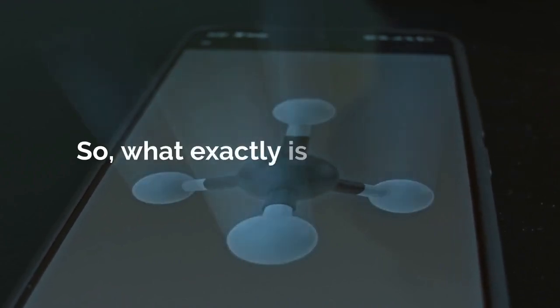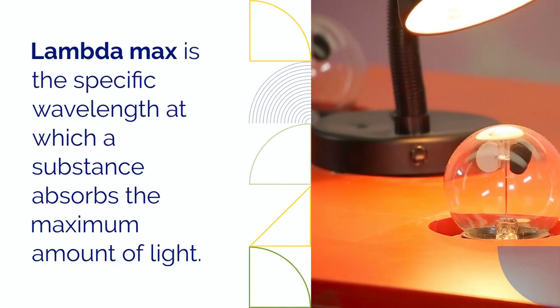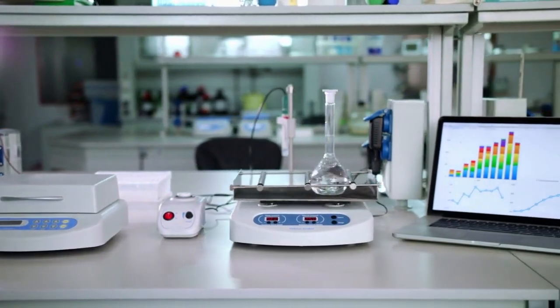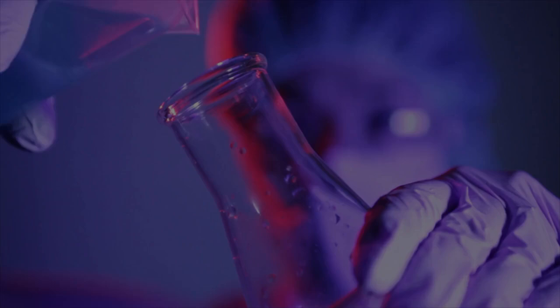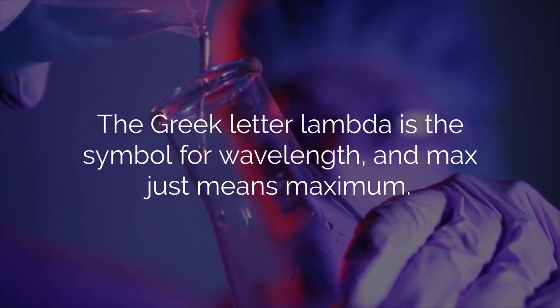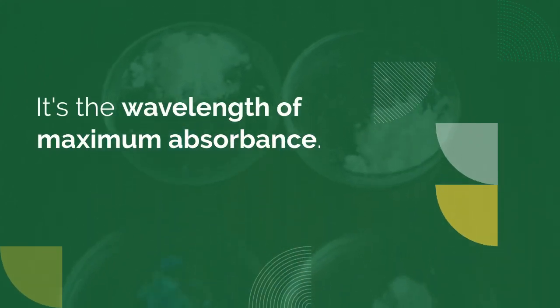So, what exactly is lambda max? It's simple. Lambda max is the specific wavelength at which a substance absorbs the maximum amount of light. It is literally the wavelength corresponding to the very top of the highest peak on the absorption spectrum. The Greek letter lambda is the symbol for wavelength, and max just means maximum. So, it's the wavelength of maximum absorbance.